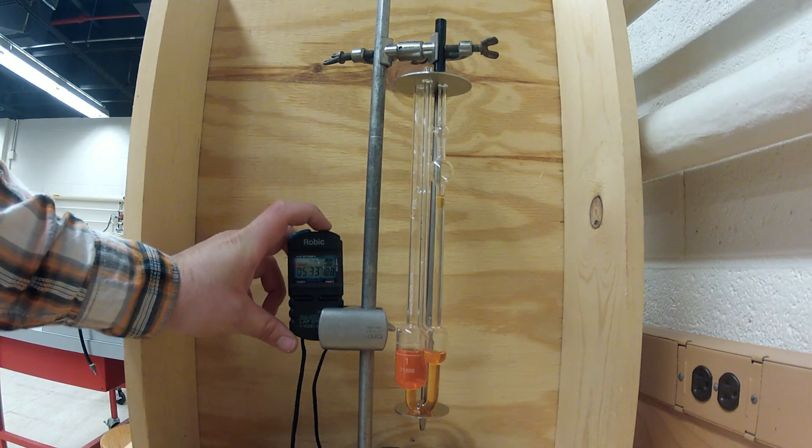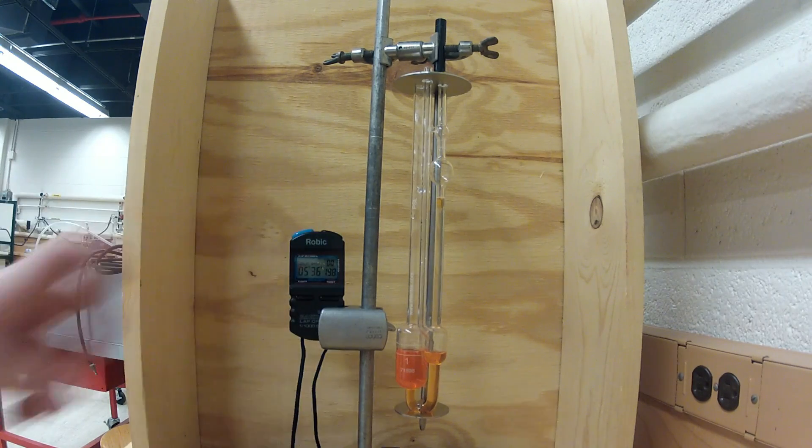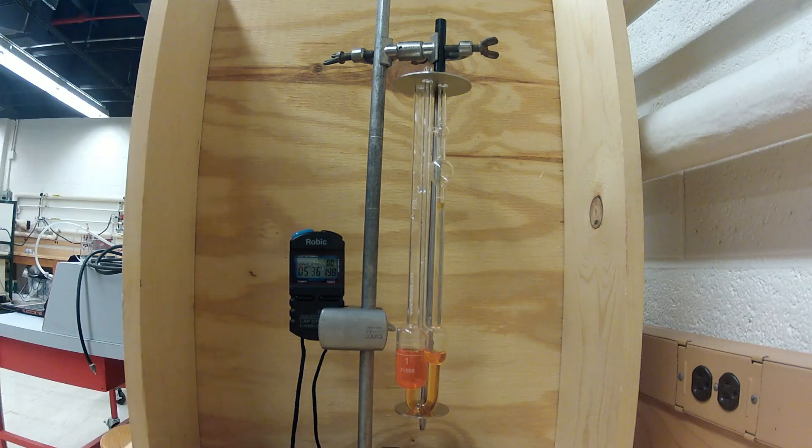Here we are stopping the timer and recording the time in the data table. This has been a presentation of the Ubbelohde viscometer. Thank you.